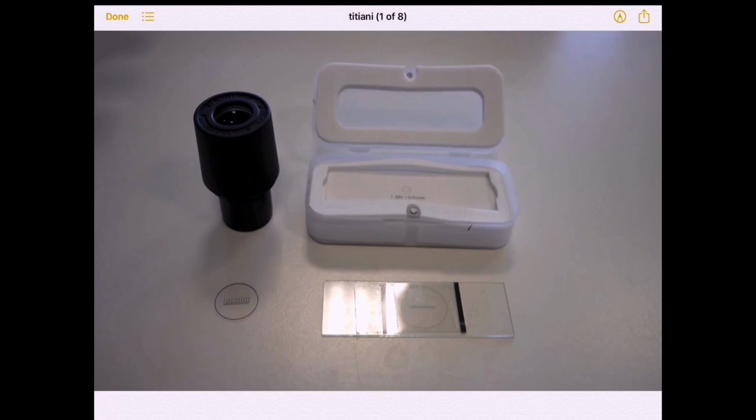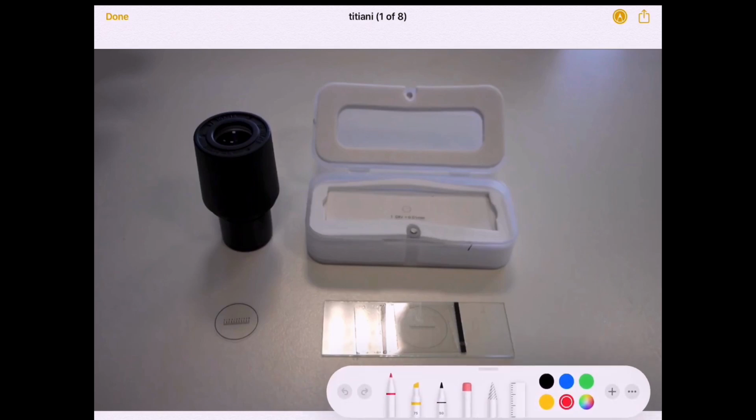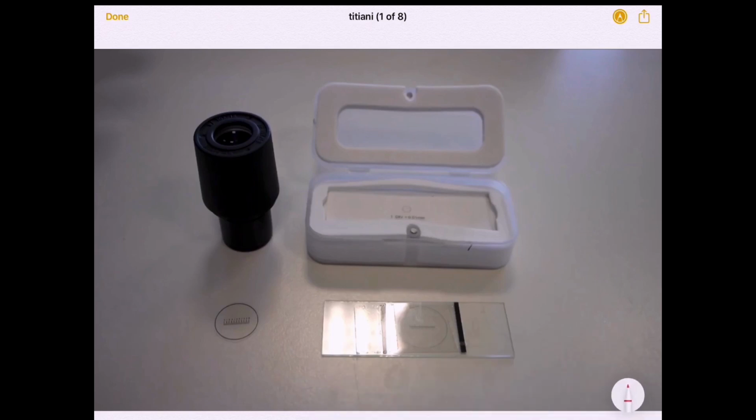Okay, today I'm going to cover the topic on AS Topic 1, Calibration of Eyepiece Graticule. So, when you are supposed to calculate the actual cell size, what you need here is a stage micrometer, which looks like a slide but with a small ruler with a known value embedded on the slide itself.